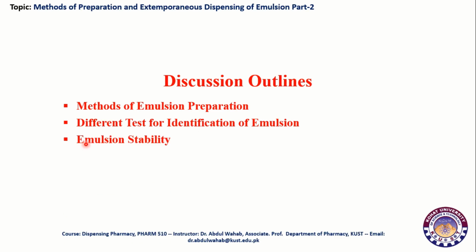Similarly, emulsion stability: after preparation we can check the instability of emulsion. We will also discuss extemporaneous dispensing of emulsions and the different extemporaneous mixtures of emulsion.